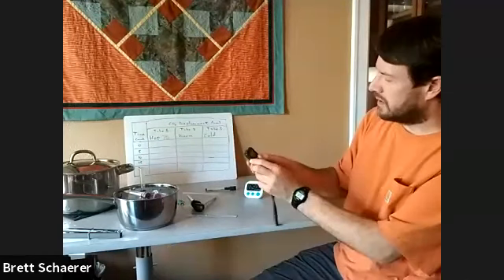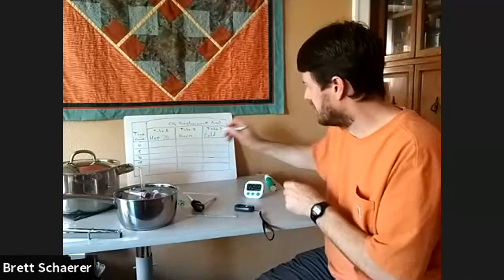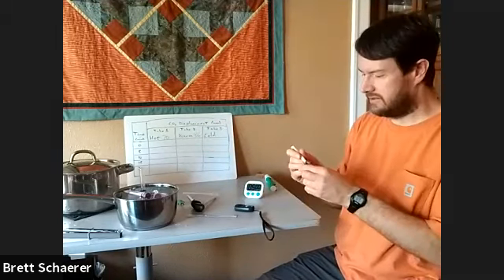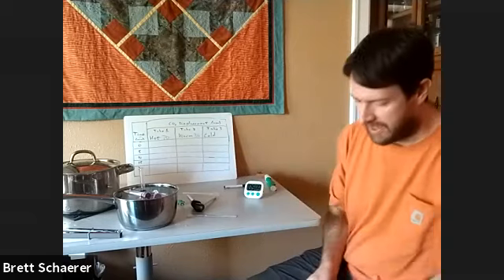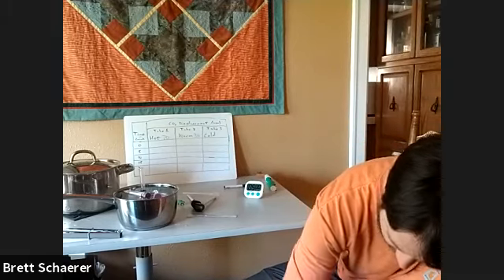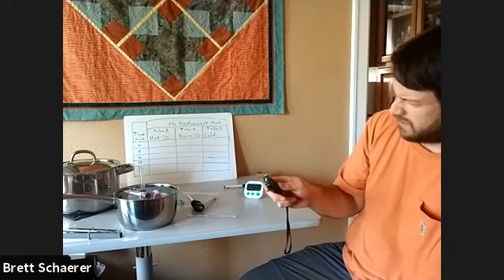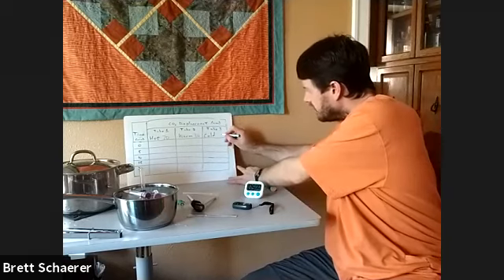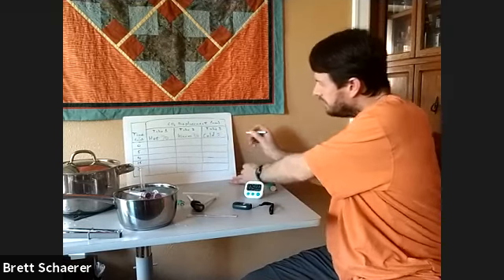And the warm environment is at 36 degrees. These are Celsius temperatures. Then the cold environment is 4.5 degrees. We'll round that up and I'll say 5 degrees. Okay.